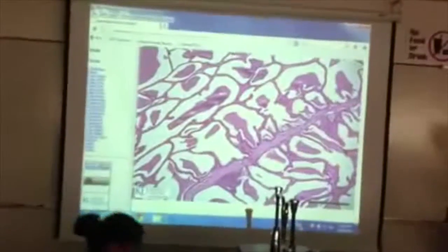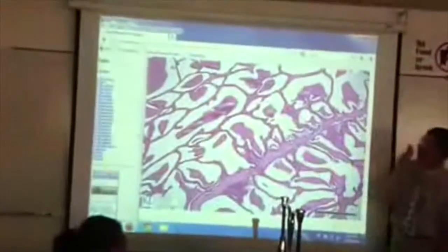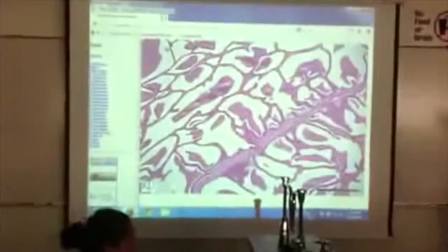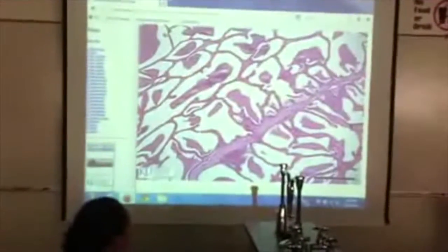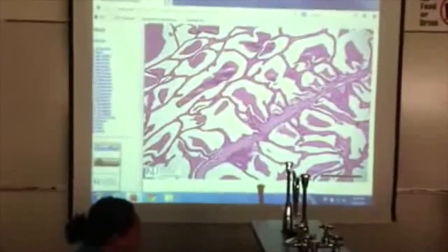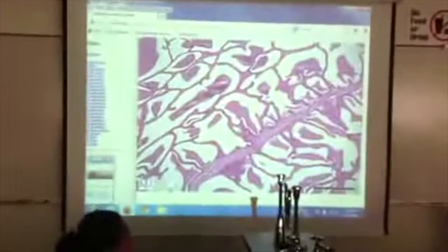And so, hey, I see a little bit of red stuff right here. I wonder what that red line could be. Huh. Smooth muscle again. But you're going to see lots of folds. Looks honeycomb, looks spongy, whatever you want. It looks like what the models have on them. Right? And I think, oh, I forgot my last slide. How could I forget my last slide?